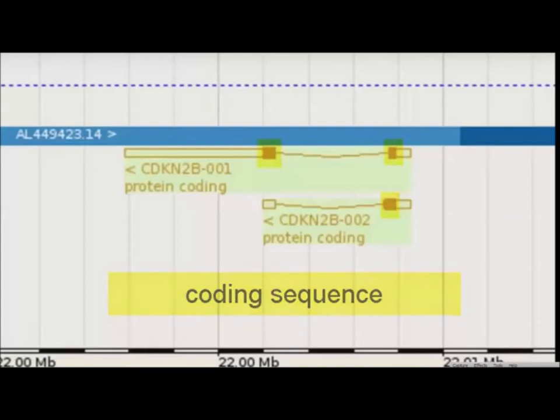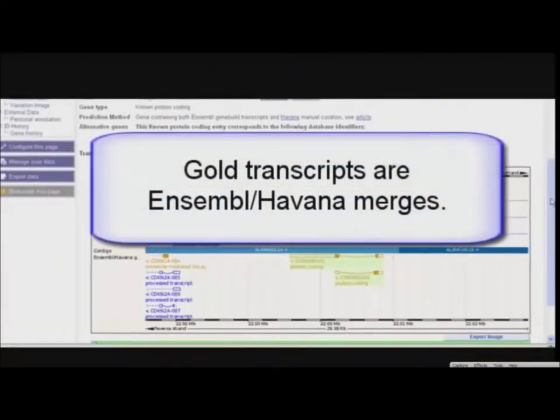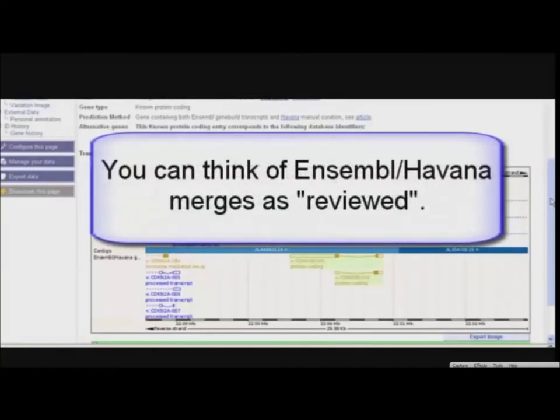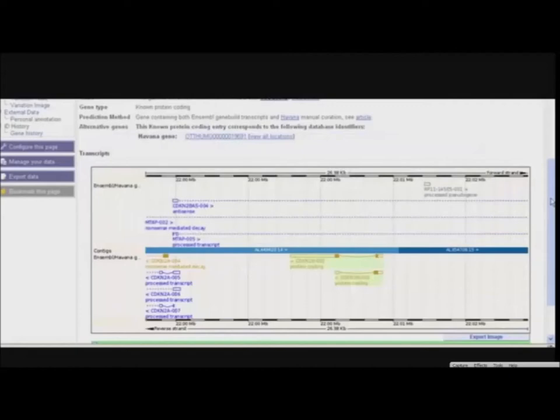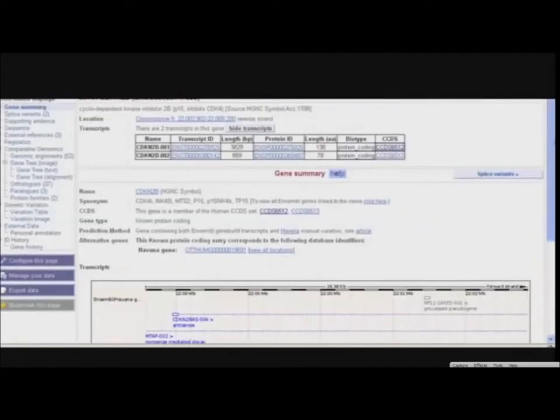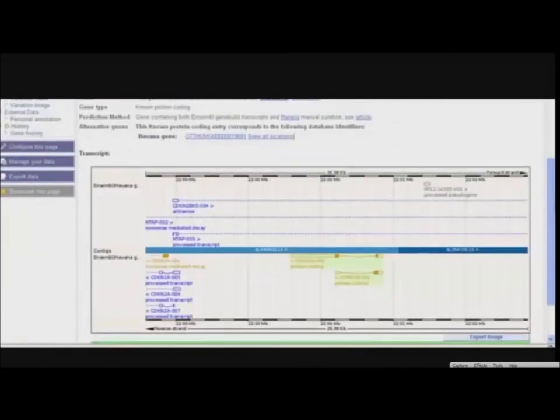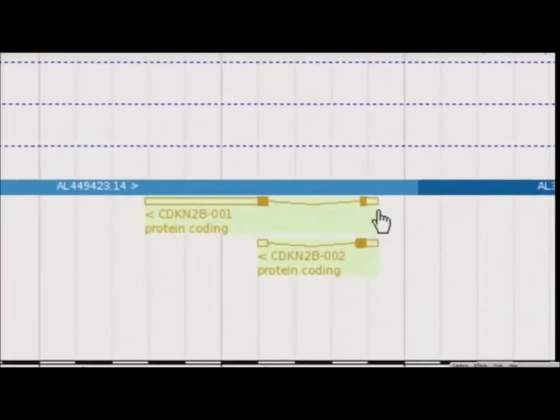Both are described as being Ensembl-Havana merges. This means the same transcript was found by the Ensembl automatic annotation pipeline as the manual curation by the Havana project. Ensembl-Havana merges are colored in gold. Let's choose one of the transcripts to explore further. We could either click on one of the transcript IDs from the table, or click on a transcript diagram and follow the link to the ENST identifier. I'll choose the longer transcript.